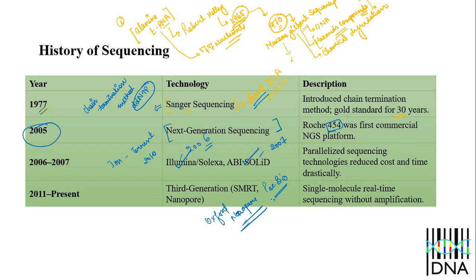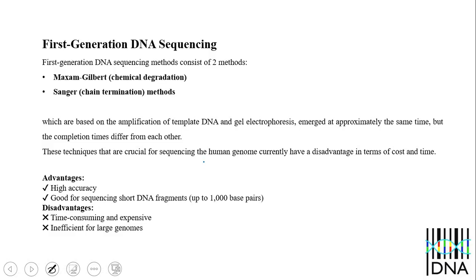Presently, most of the time we use next generation sequencing and Illumina sequencing. This is a little bit of history about sequencing. First we discuss the first generation of sequencing.